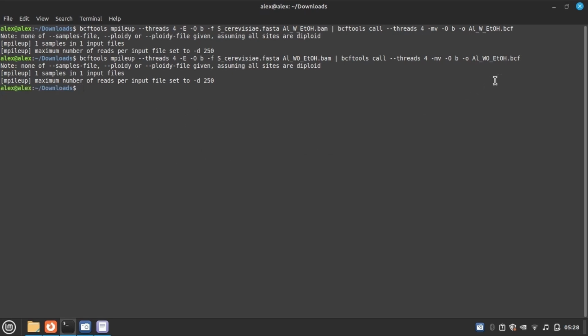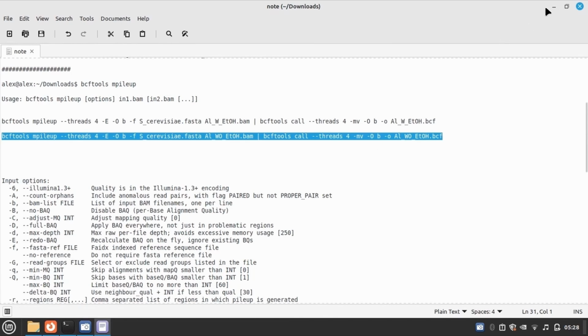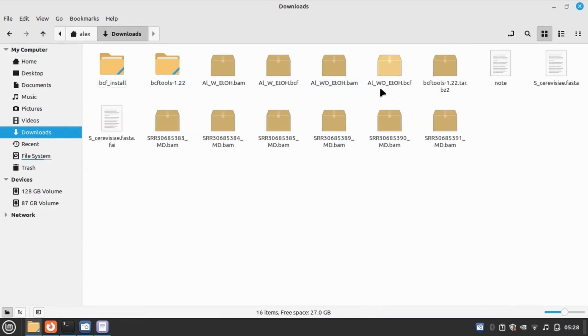So it is done. Let's check it. So here is the second BCF file. So just open it.